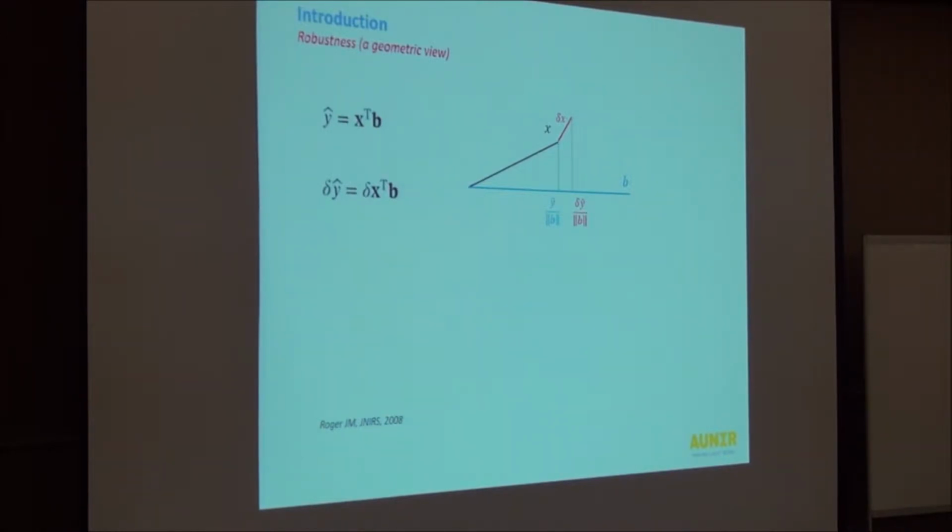What else can we do? Pre-processing. All the pre-processing methods that were discussed so far can address that problem, to reduce the size of perturbation. SNV, for example, derivatization, baseline correction. So you can reduce the error on the prediction by reducing the perturbation there.